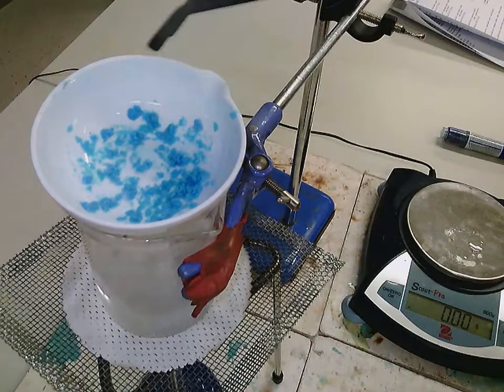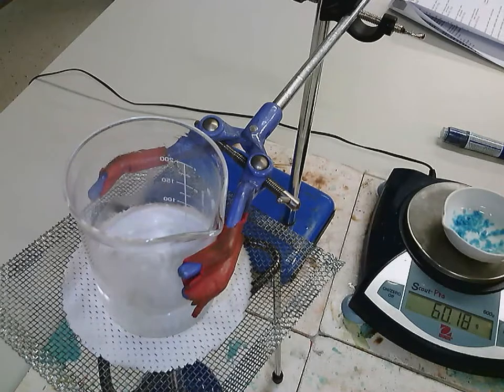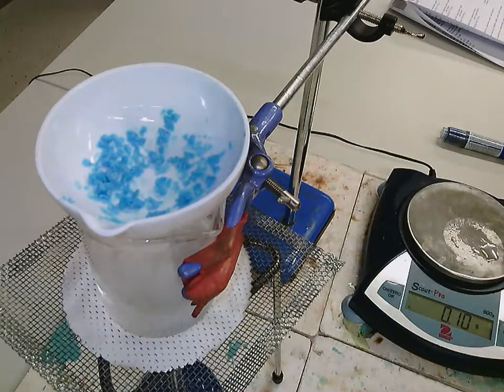So it was 60. So now 60.16. So remember, it's evaporating because this is so hot. It's evaporating right now. I'll leave that on there and pause the video and be back in a minute and we'll do it again.